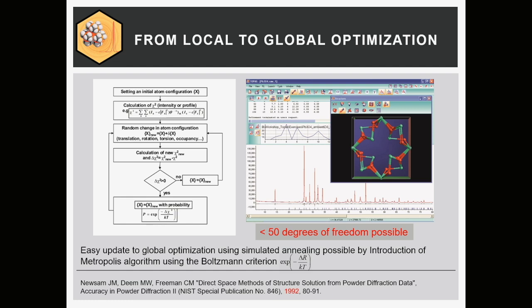As soon as they are a little bit more separated, they count as two, but with a lesser weight. And if they're completely separated, they have the full weight. Okay? So you have a list in the computer, let's say, of 200 peaks from the powder pattern. Maybe 30 peaks are separated, and the 160 have a greater or lesser degree of overlap.